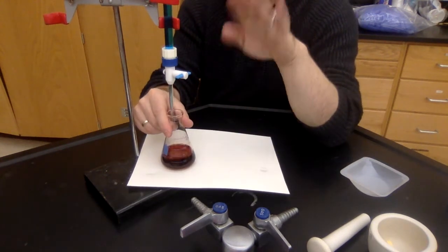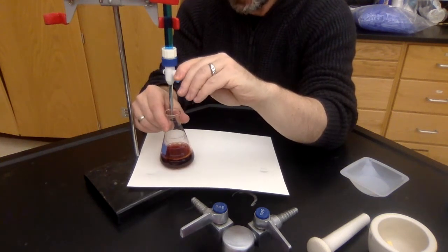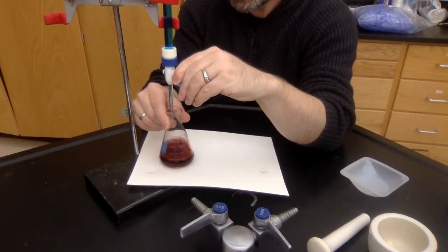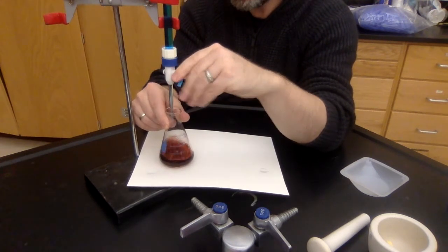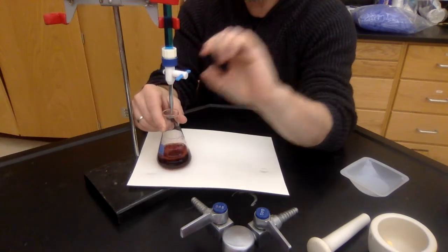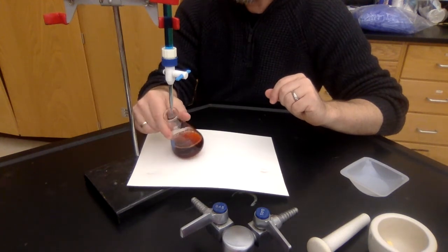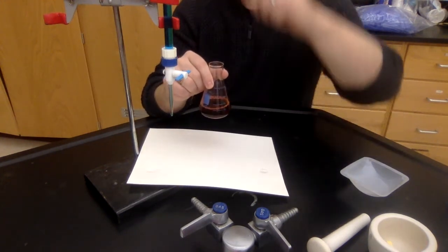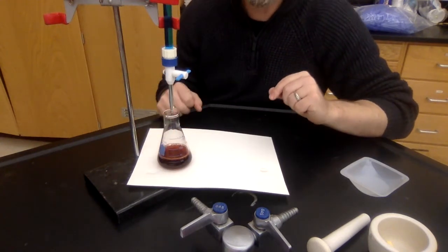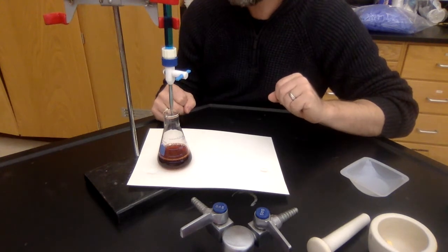When you really think you're getting close and you're ready to be going drop by drop, you are going to just try to ever so slightly adjust it so that it just barely seems like it's open and you're doing little drops. And whenever you see it do that persistent color change, you turn it off and you can take this out and get your final reading from up above. And then you use the difference in volume to run your calculations.